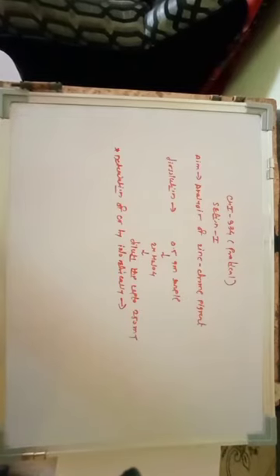We are very much familiar with this iodometric technique for the determination of metal ions. Iodometry means the titration in which the liberated iodine is titrated with Na2S2O3 solution. Whenever there is iodometry, there is a titration with Na2S2O3, that is sodium thiosulfate. So we are interested in the determination of chromium by iodometry.